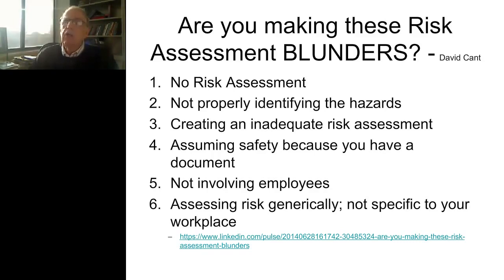Competency for using a biosafety cabinet. Competencies for donning and doffing PPE. Competencies for spill cleanup. Those are just three examples of things that you could do in your laboratory to incorporate biosafety into your competency program.